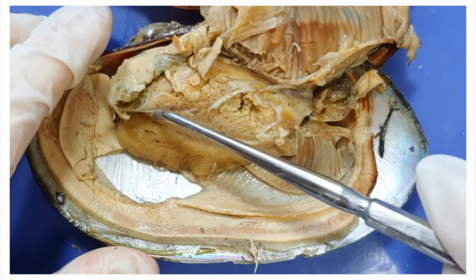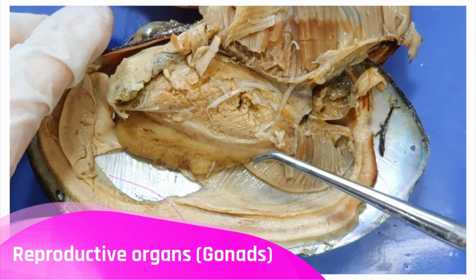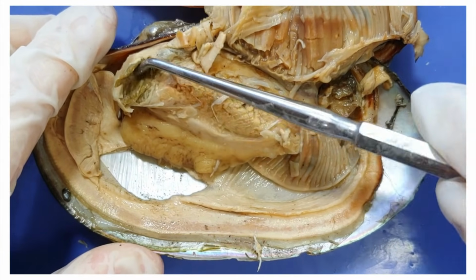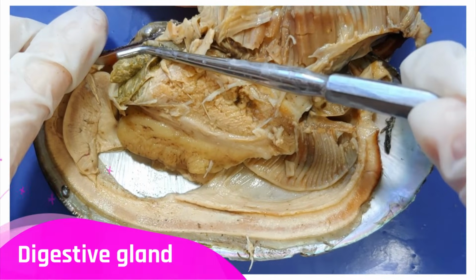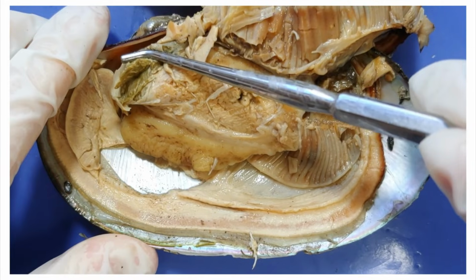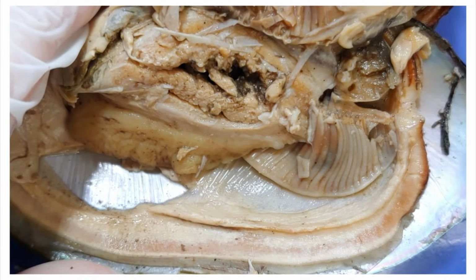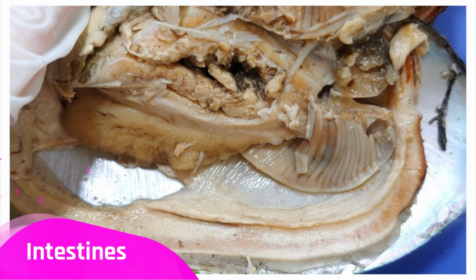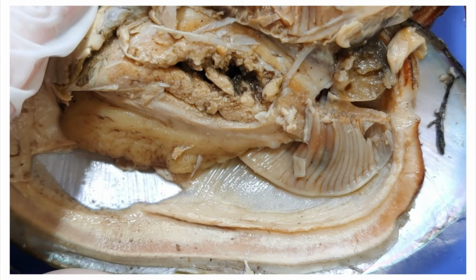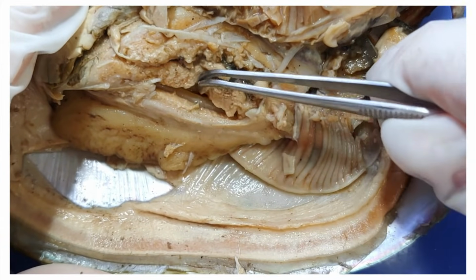Okay, so the yellowish mass you see here are the gonads, or the reproductive organs, which is also the term for we can't tell if it's male or female. The greenish thing here is the digestive gland, which releases digestive enzymes that helps the clam digest its food. Another part of the digestive system of the clam are the intestines that are buried in the gonads. We're gonna look for that. So the intestines absorb the digested nutrients from the food that the clam digested.